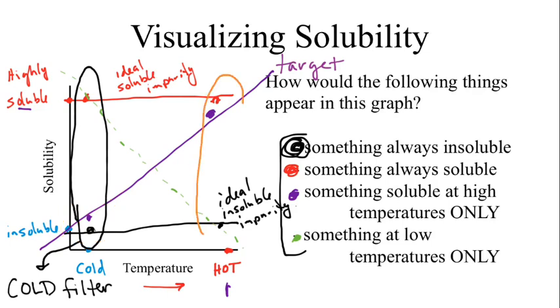What happens when I heat it up? Now when I look at my target compound solubility versus my impurity, different solubilities. So now I could go through and separate them. What would I need to do to separate it then? Again, it's a filtration, or filter, because that's what I've been using. We'll stick with filter. But if it was a cold filtration, it wouldn't work. I have to make it a hot filtration.